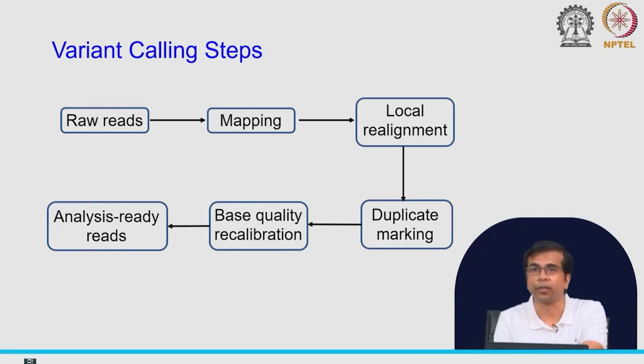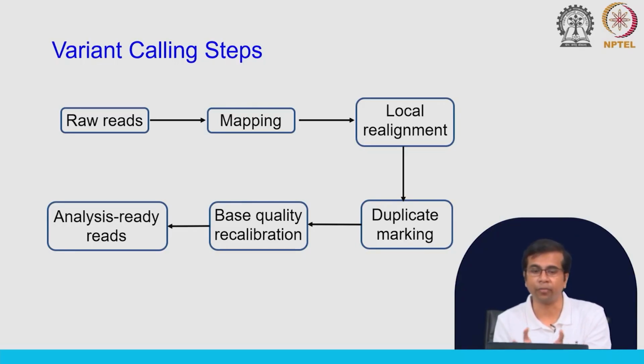But of course it will not be possible for us to complete the full variant calling pipeline in this class if we do that, right. So, what I have done is I have also compiled all those commands that we will use for doing this variant call, and we will simply run them, and I will show you, right, that at the end we get the variants. Okay. So, there are multiple steps.